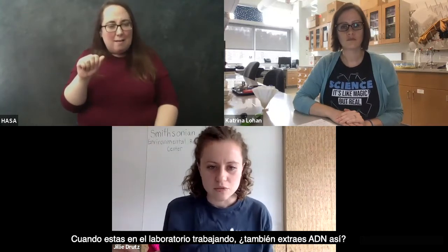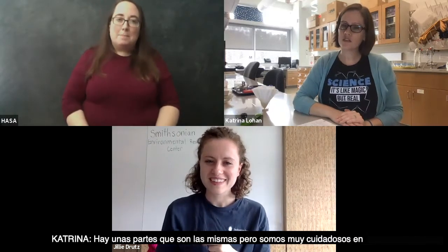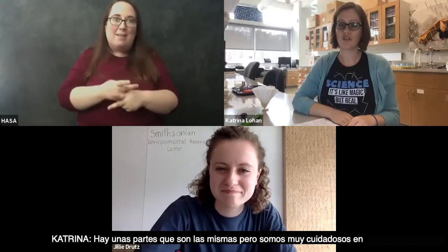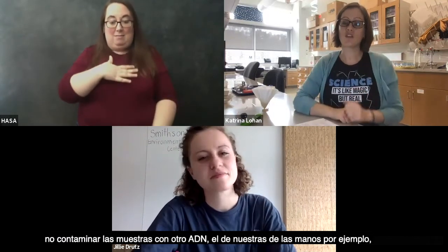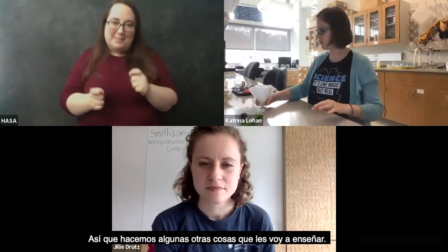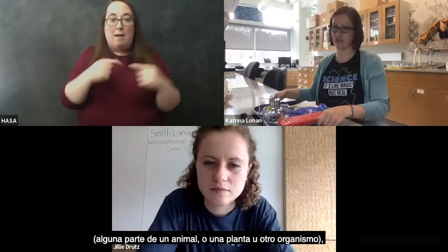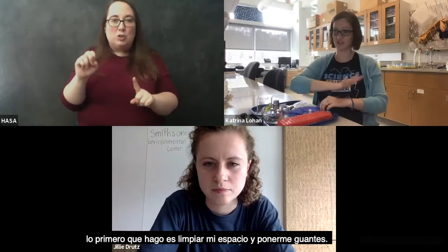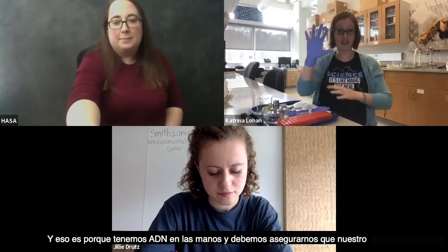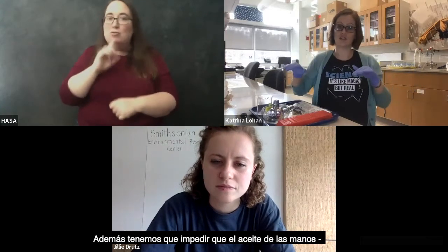So when you're in the lab doing your work, is this how you extract DNA too? There are parts of this that are the same, but we are very careful about not getting our own DNA in the samples, and also about not mixing DNA from one sample to another. So we make a couple of tweaks, and I will show you some of the stuff that we use. When I come into the lab to extract DNA from tissue, the very first thing I do is clean my space and put on gloves. That is because you have DNA on your hands from yourself, and you want to make sure your DNA does not get into your samples.